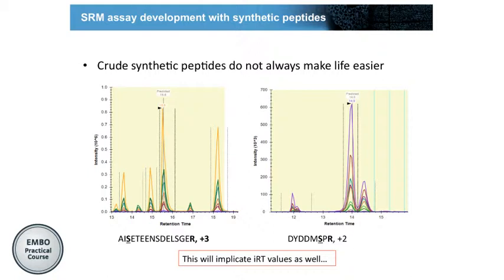But this would not affect the retention time. This would be right if that was a deuterium kind of labeling. This would affect retention. Deamidation is 0.9. Deamidation, very good.